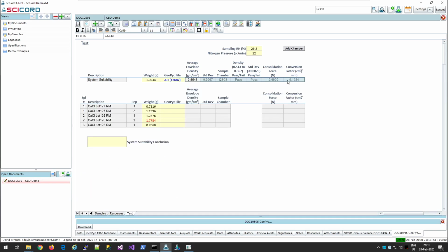Additionally, the contents of the report file are parsed into individual cells to display the final measurement and specific operating parameters which indicate the suitability of the measurement. As each instrument report becomes available, the report is recorded to the appropriate sample and sample replicate.